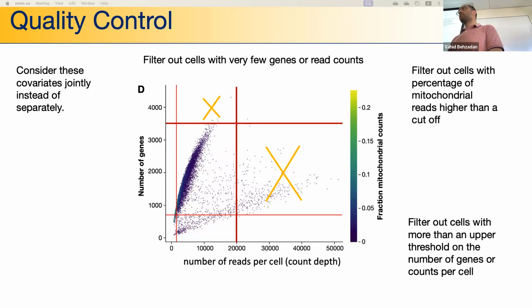Is this based on the same type of cell, or is this with a variety? That's the variety of cells. So initially, you don't know what cells you have. You get a sample from a solid tissue or from the blood, and then you separate the cells and analyze, count and quantify the transcribed genes in each single cell, right?